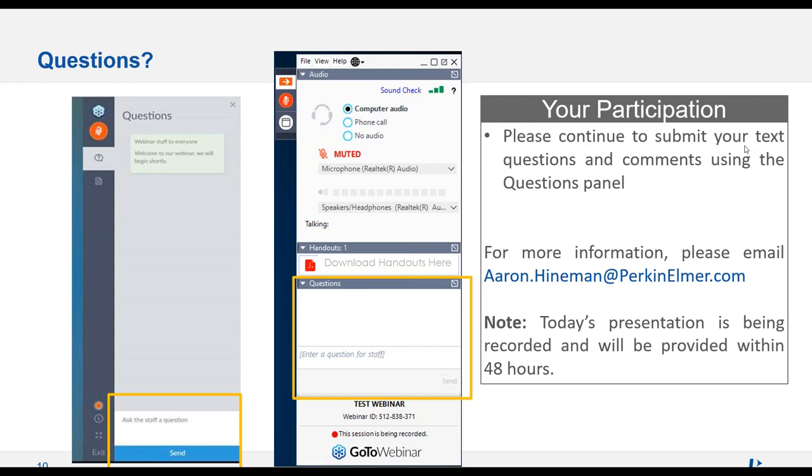All right, so a couple questions here. First one, thanks, Zach. This is an excellent presentation and very helpful. So two quick questions, a two-part. Can a NexION 300 do this work? And then the second part is, is a clean lab necessary for lithium isotope sample preparation?